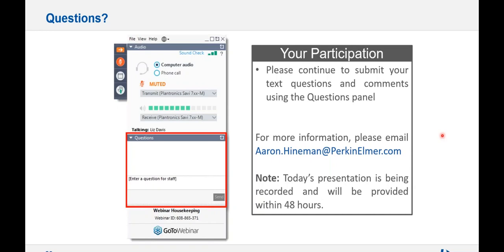And then I have another question. It's more of an applications thing, they're trying to get help with beryllium. Any tips? Again, I would send an email to the AA Tech Support mailbox. I know I've collected a bunch of application articles over time, but you can also contact your application person, what we used to call product specialist.